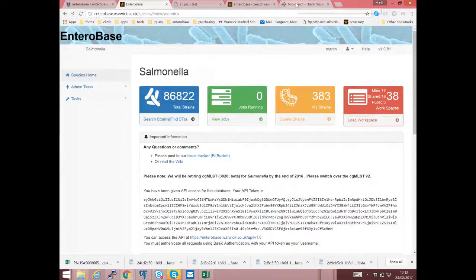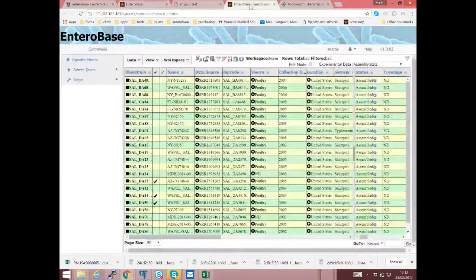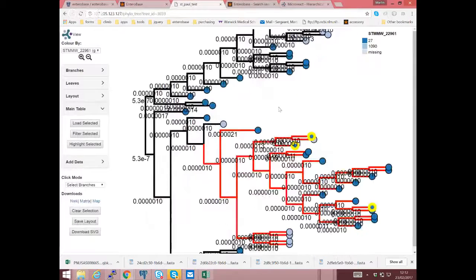So in response to branch lengths and bootstraps, the branch lengths were the substitution rates calculated in maximum likelihood. So that's what Martin was showing on the tree. We are currently not running bootstrapping. Bootstrapping only works for uncertainties due to lack of data.